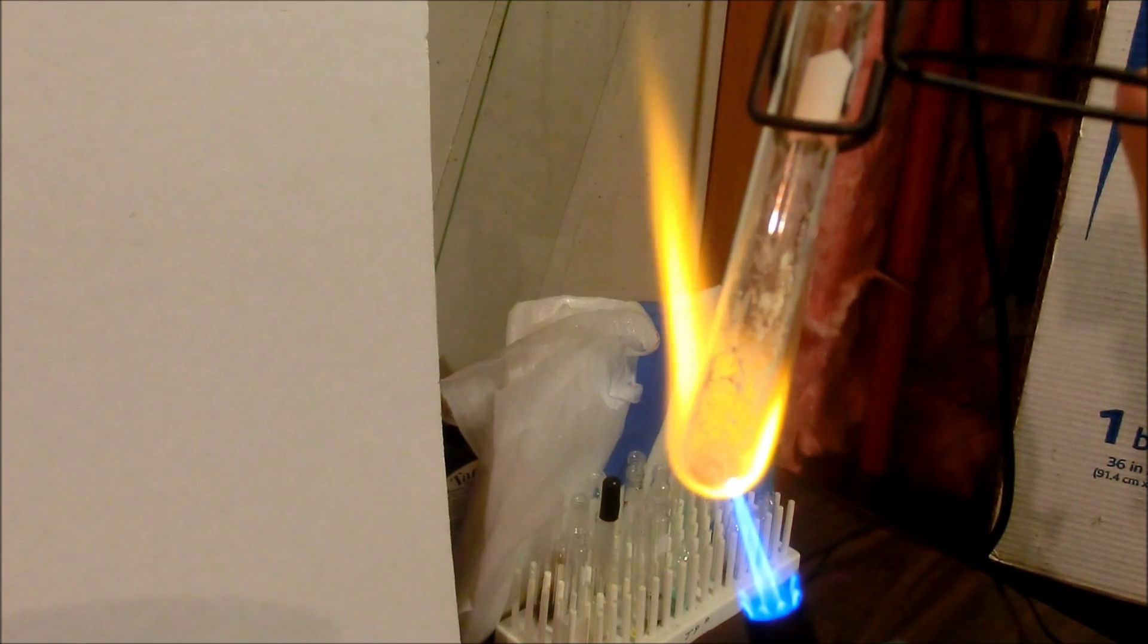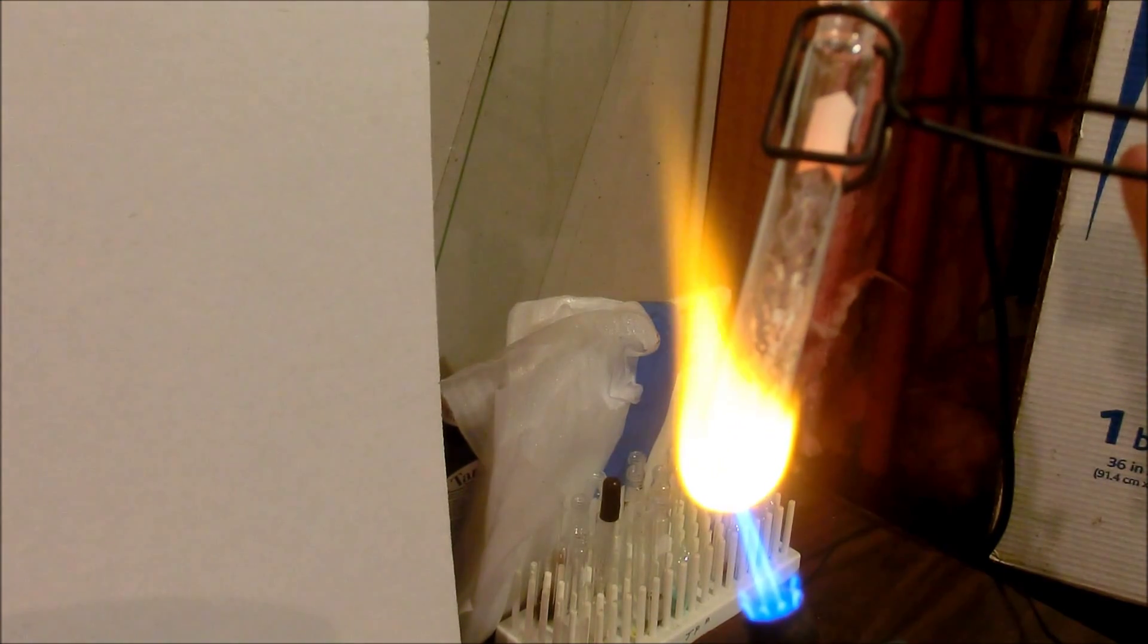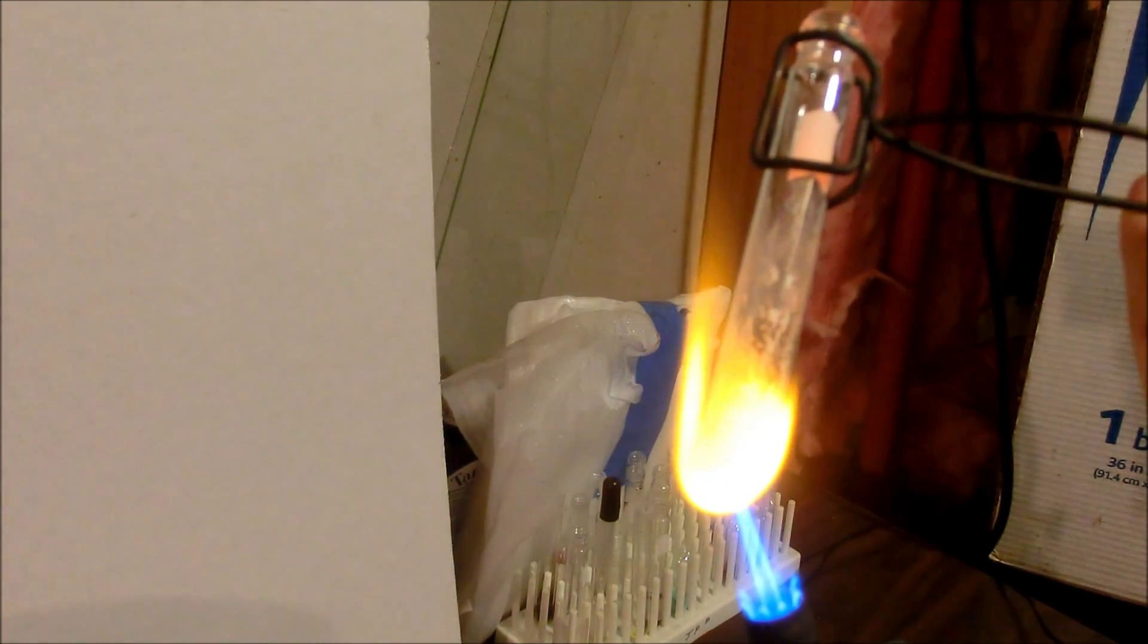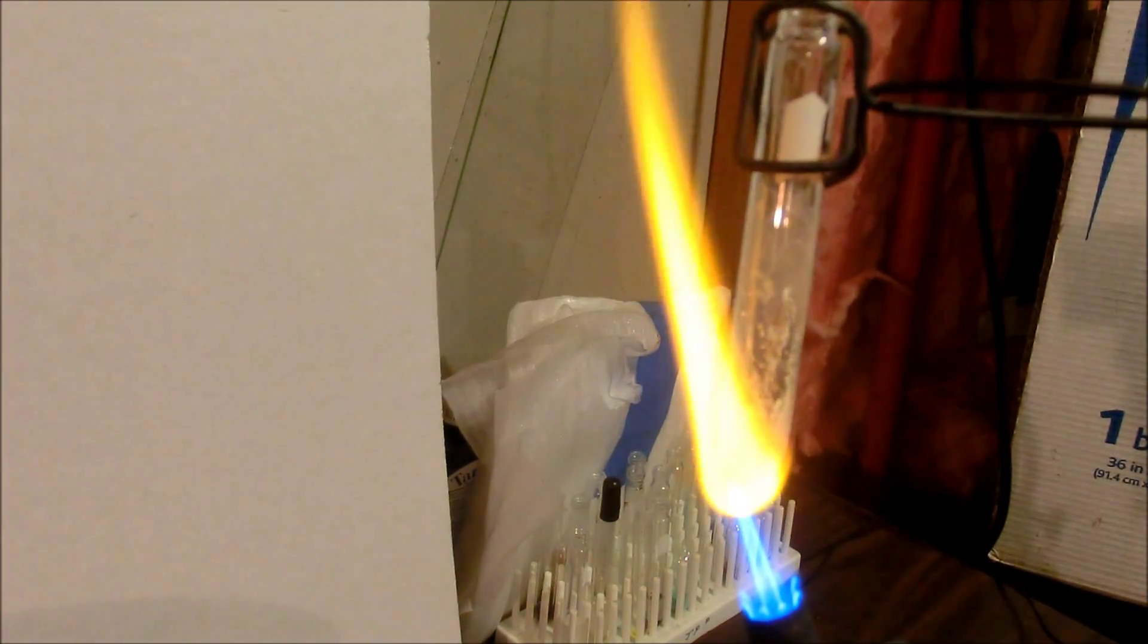As you heat the zinc sulfide will turn a yellow color and eventually it should begin to glow under the heat. And what's happening here is we're crystallizing the zinc sulfide into the wurtzite phase. And some of it's zinc blend. And that's what we need for it to be phosphorescent. But I'll just continue heating this for another 10-15 seconds.